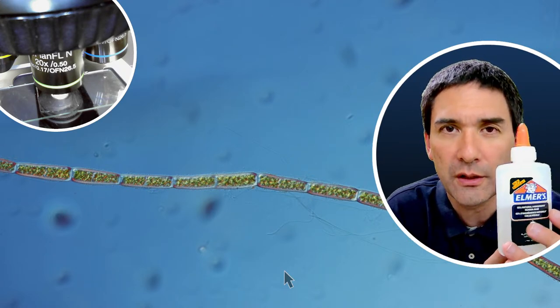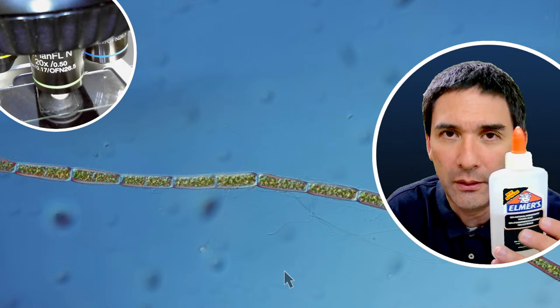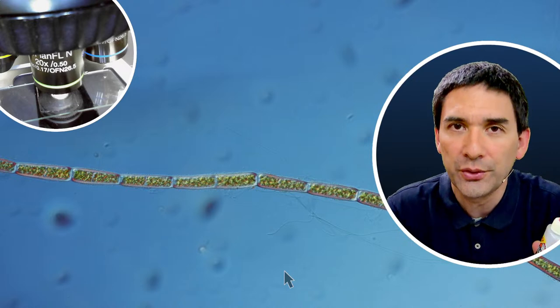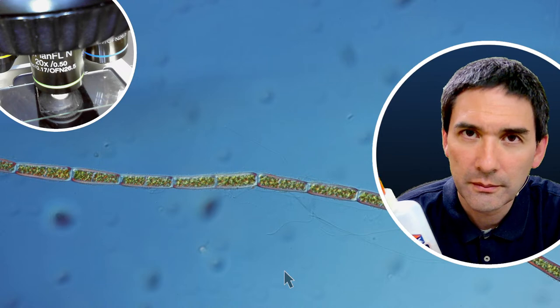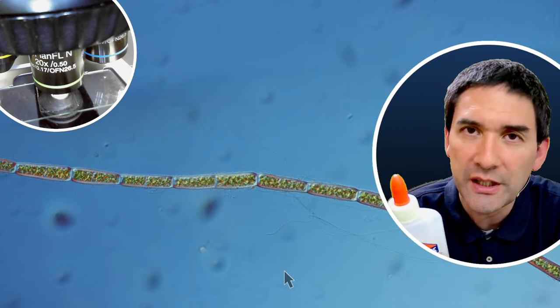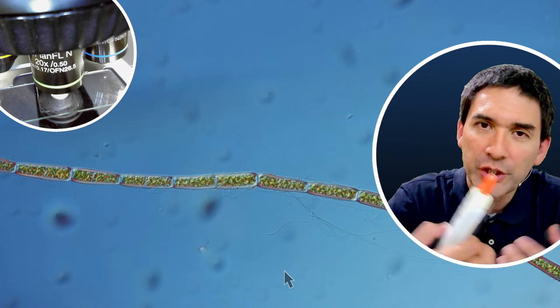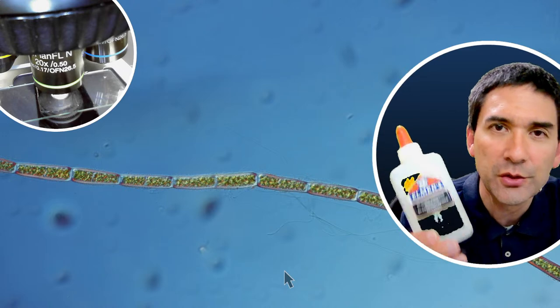If you use mounting media that contain organic solvents, for example, what can happen is that the specimen loses the color because the color is kind of washed out. For example, if you use mounting media like Euparal, which can contain solvents, then there is the danger that they will dissolve some of the pigments of the specimens, and then they will lose color. But if you use a water-based mounting medium, then this is not going to happen.